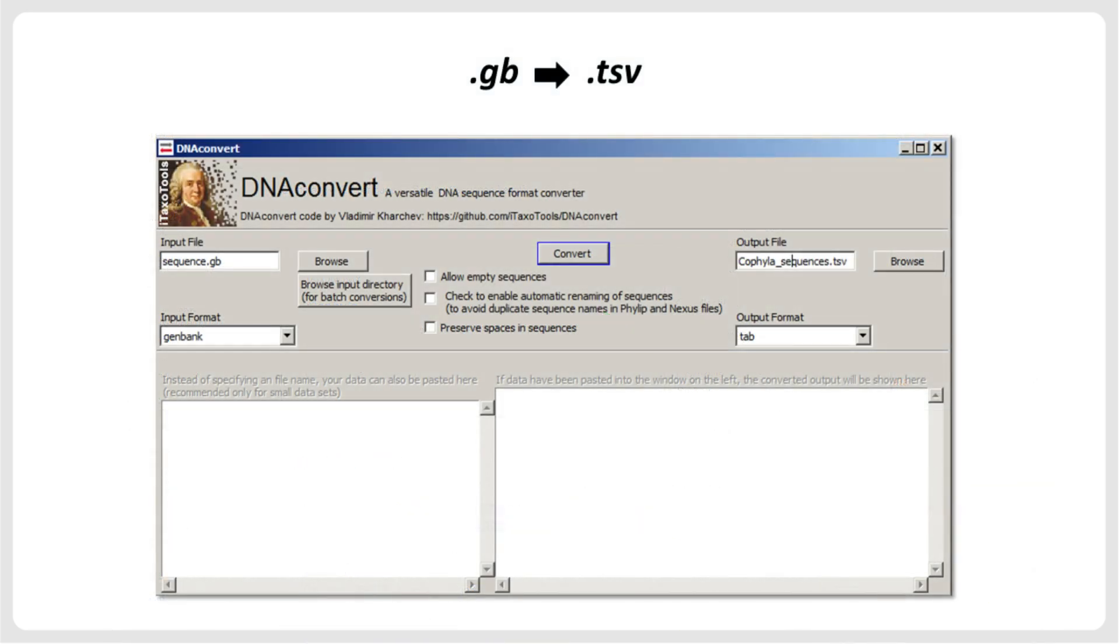Next, we use the tool DNA Convert, which can be downloaded from the iTaxoTools website. For more detailed information about the features of DNA Convert, see the video tutorial focusing on this tool. We now use the Browse button to select the file we downloaded from GenBank and specify the input format as GenBank.